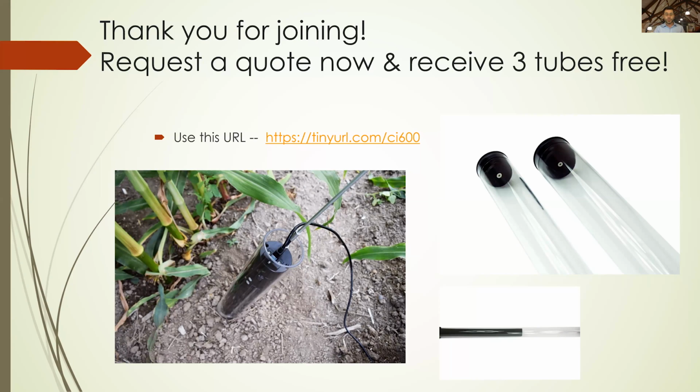Let's see, how does it work for bigger roots, perennial trees? Because of the scanner head, actually it works fairly well. Of course, it really depends on the root size. If you're thinking about roots larger than, say, a couple inches, you're only going to be getting them at a glancing angle to the tube. So you'll still be able to see a few, but you're not going to see nearly as many as you would of the smaller root structures and systems.